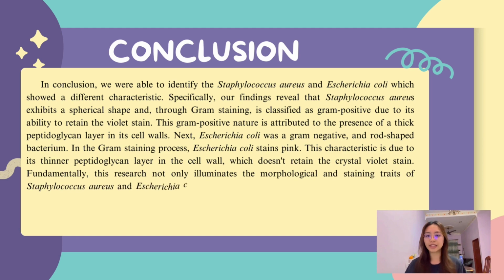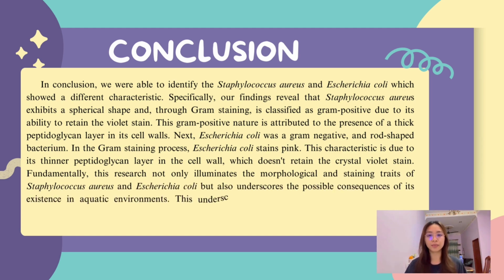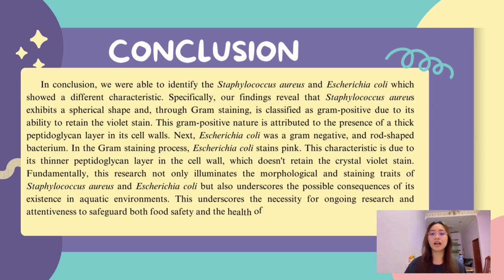stain. Fundamentally, this research not only illuminates the morphological and staining traits of these two bacteria, but also underscores the possible consequences of their existence in the aquatic environment.